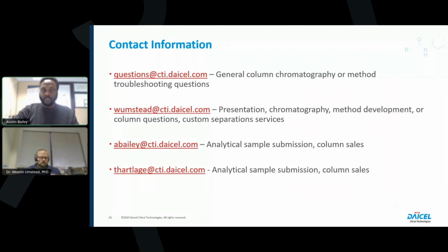All right, thank you, Wes. And I do have one here from Mehmet, just asking, am I hearing you right, that you will announce a new column for separation of amino acids? Yes, that is correct. We are going to be releasing a new column here this week. I will go ahead and just let Wes add any more that he feels necessary to that.